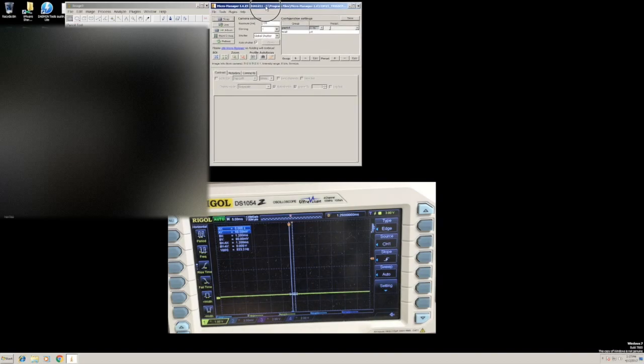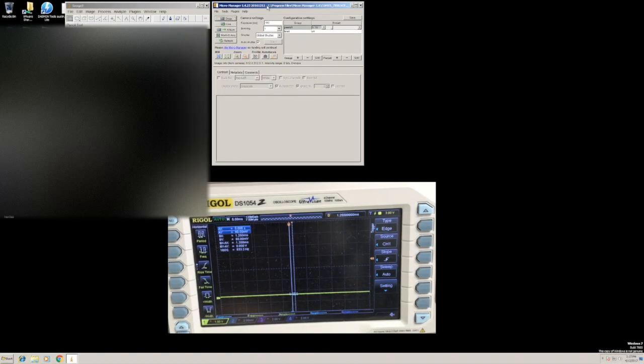So anyway, what this does is it takes any of the 16 output channels and it allows for pulse width modulation on those channels. So if you had TTL1, normally that would be on or off, but in this case, on enables pulse width modulation and off will set the line to an off state. I've integrated this into the Micromanager driver, and so what you see here is PWM control.